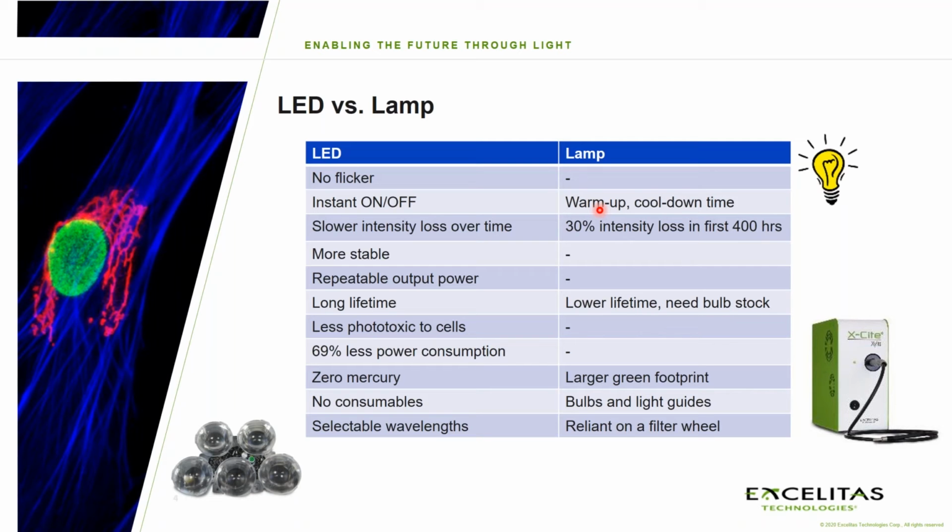I remember using an HBO lamp at my advisor's office, and she said, make sure you turn it on, wait for about half an hour, and then do not turn it off or the thing will blow up. And she basically scared the life out of me. So I was scared of that lamp.